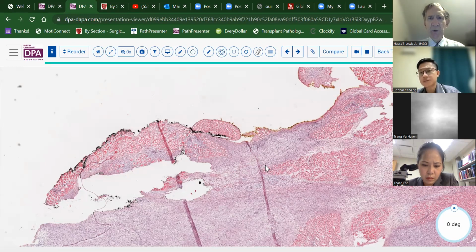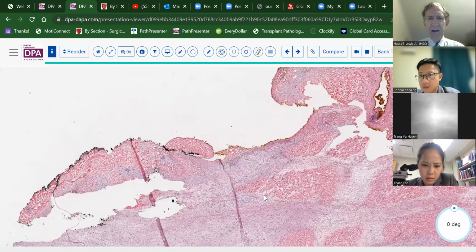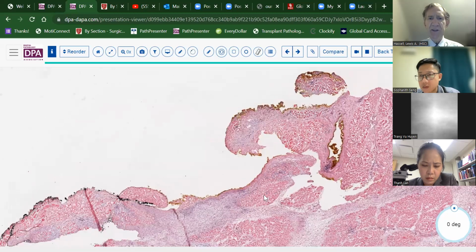The second thing which we do as we apply ink to the surface is that we will then use what would be termed a mordant or a coagulant type of reaction that helps to fix the ink to a slight degree on the surface, so that it doesn't run, and so that you can use it without having to wait for a long time for it to dry, for example.